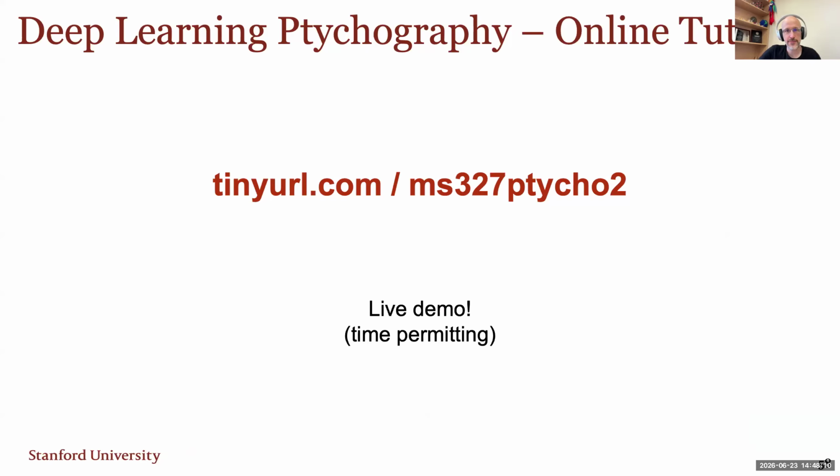Okay, so I mentioned a tutorial for this one as well. Please feel free to copy down this tiny URL address. And so this is a deep learning ptychography DGP tutorial that has been placed in Google Colab as well. And this is using that metal organic framework data set too. And so it's a slightly restricted, binned, cropped version of it, so that it would run in the tutorial window. But you can go through yourself and see how we do these pixelated and machine learning driven reconstructions.